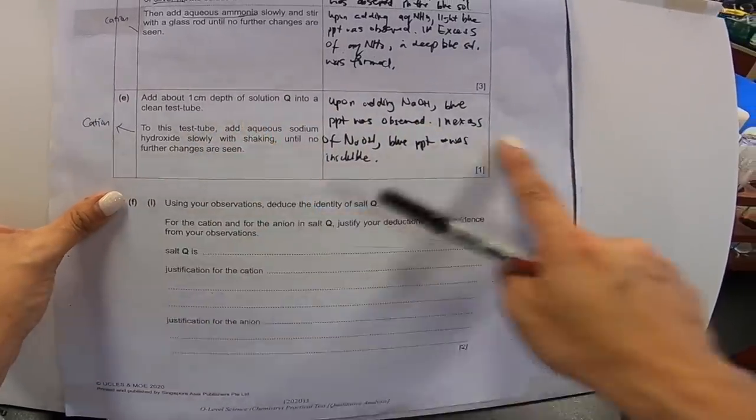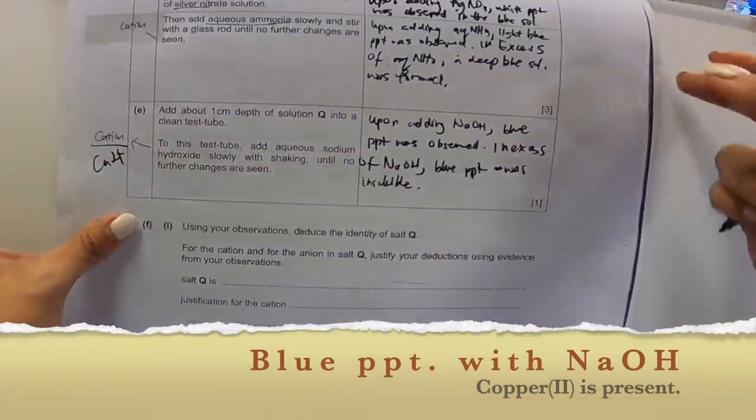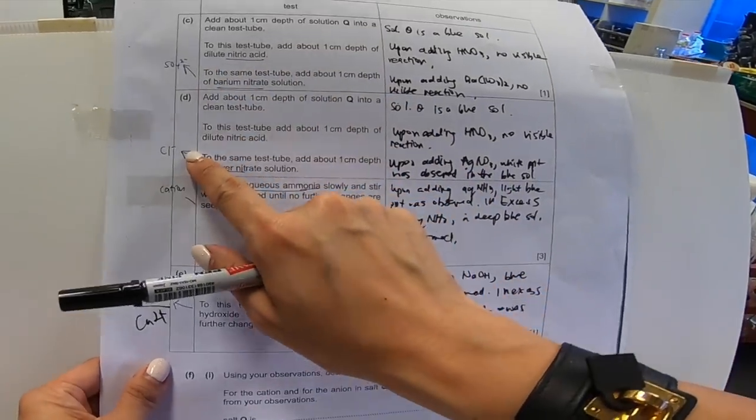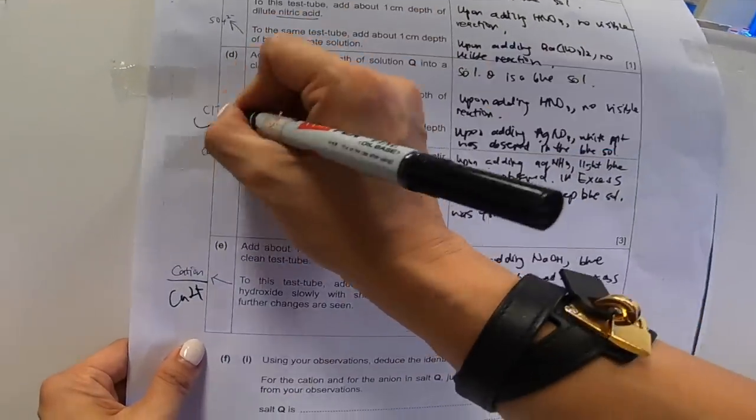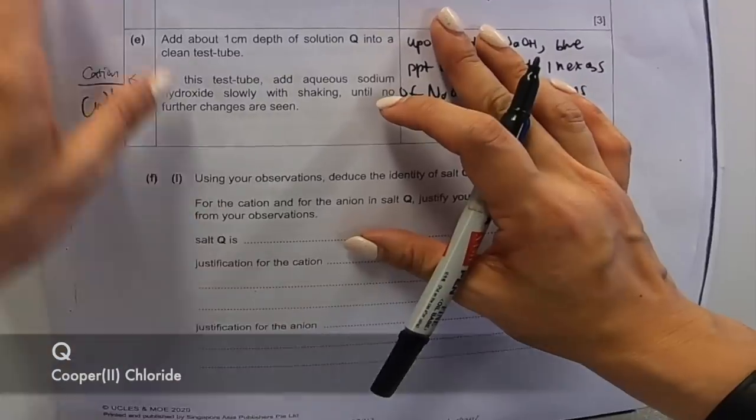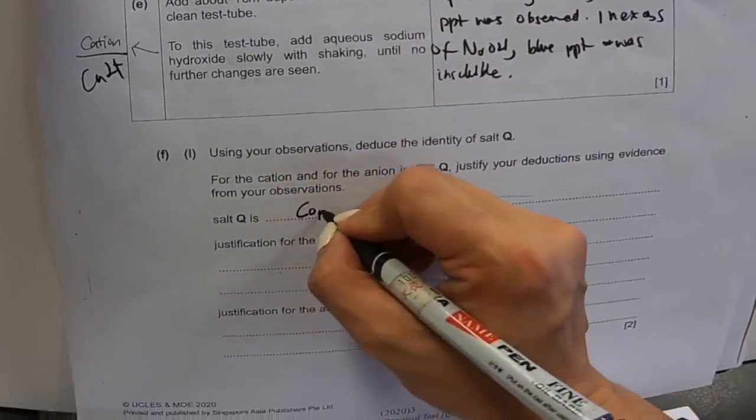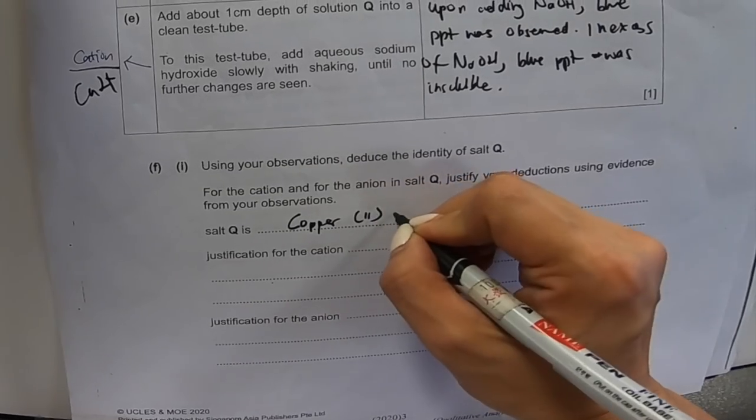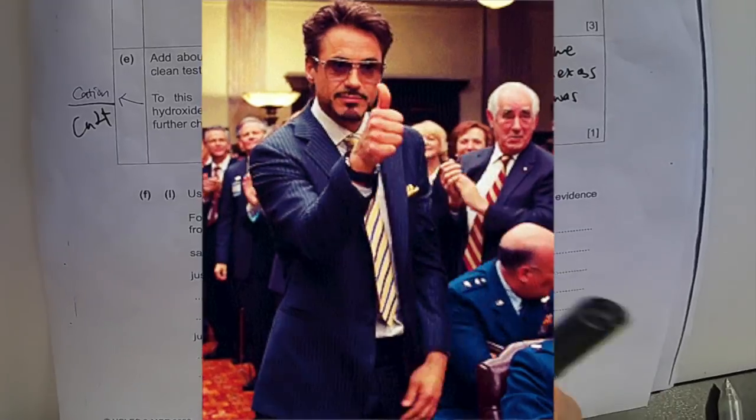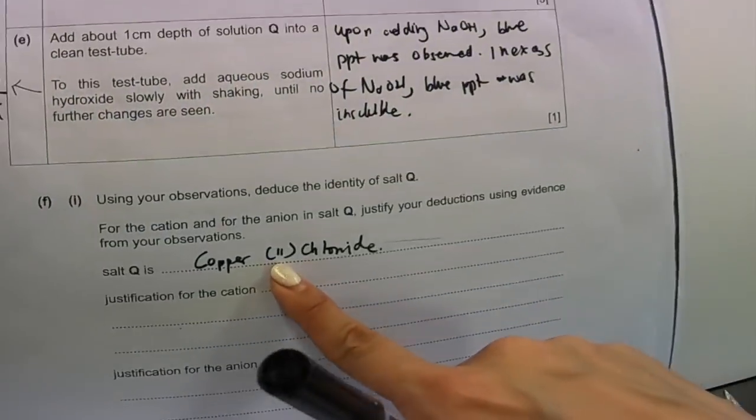Q, since this part is blue, and I say just now, if it's blue, I know that this, the cation is Cu2+. Now, between the two anions here, whether is it sulfate or is it chloride, well, chloride is the winner. So I know that Q is actually copper chloride. And because it's copper chloride, I need to write down Q is copper 2 chloride. Make sure that you include the two because this is transition metal. So it's important that we write down the two over here.